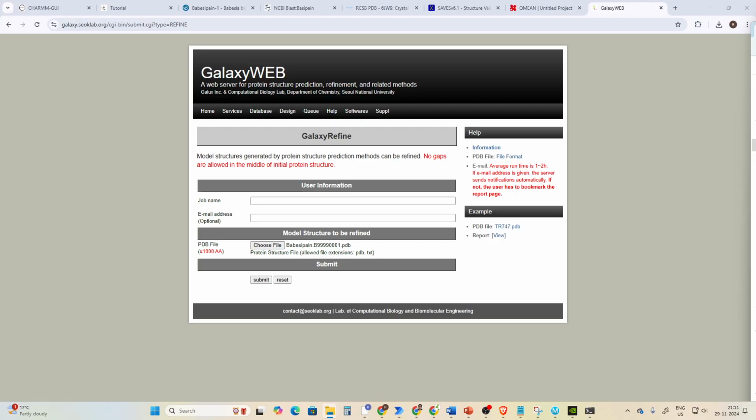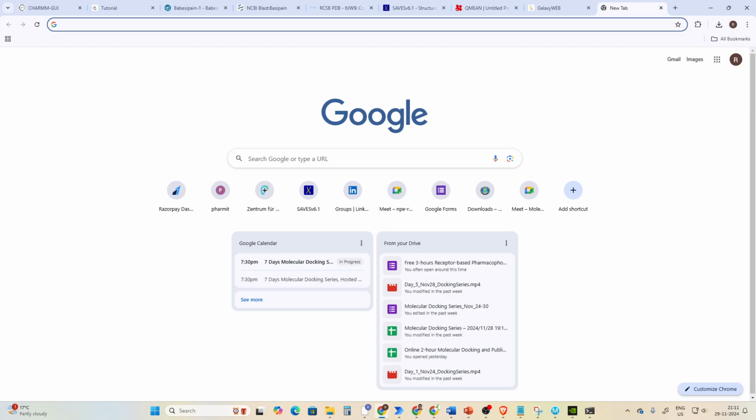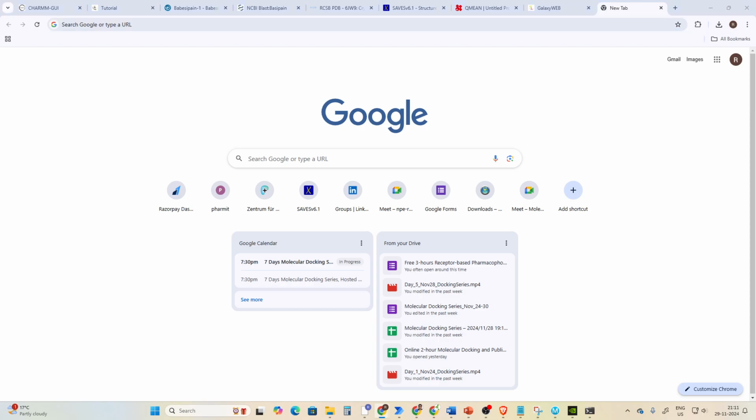Galaxy Refine, where is that? Let me get that. Galaxy. Yeah.